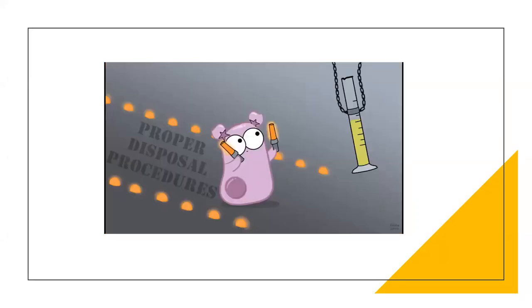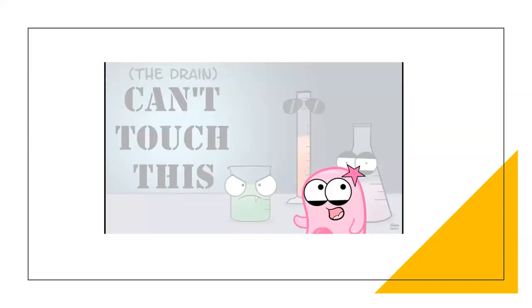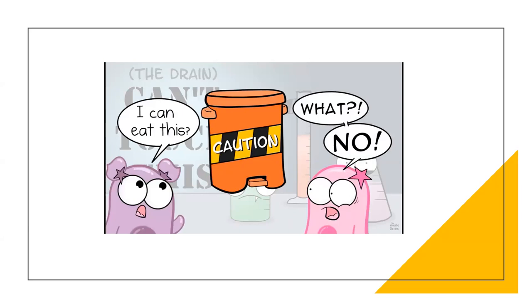When you're done with a chemical, you want to make sure you properly dispose of it. Many chemicals can't just be put down the drain. In fact, some solid items that you use in your labs also cannot be thrown away in the regular trash and have to be disposed of as hazardous waste. Always check with your instructor.